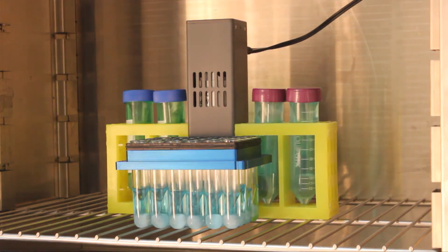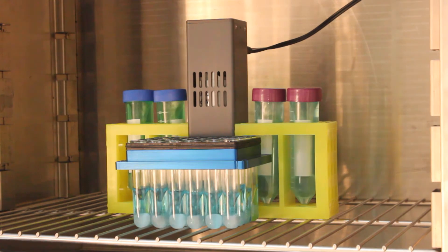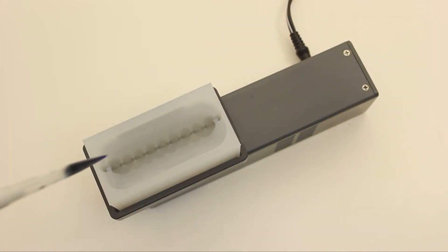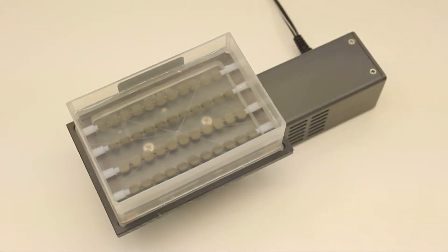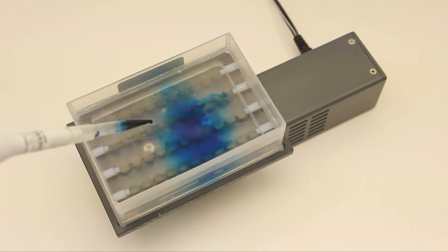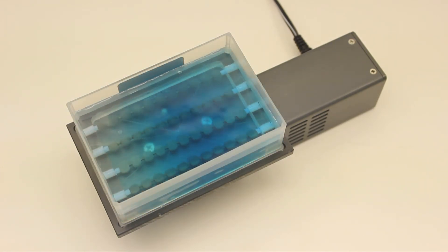The stirrer is also small enough to fit inside an incubator for temperature control. Transform the Multi-Stirrus into a tumble stirrer by placing it on its side. Using the multiple deck accessories in this mode, it can be used to power VMP's bubble paddle reservoirs to keep cells, beads, or particulates in suspension for uniform pipetting.